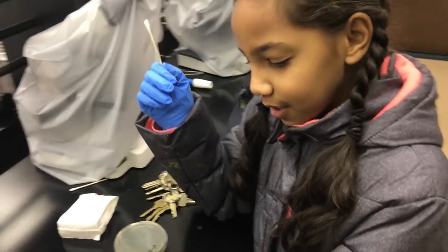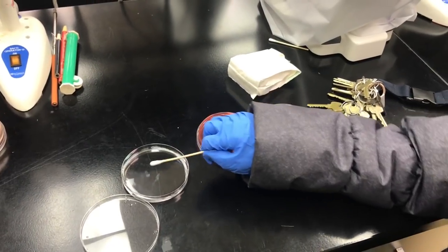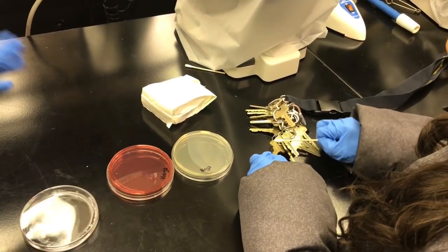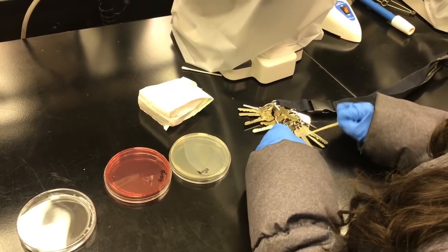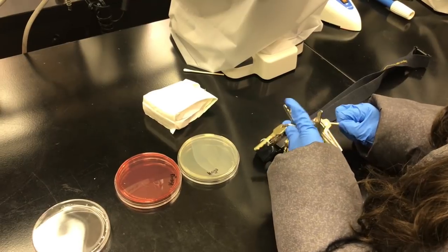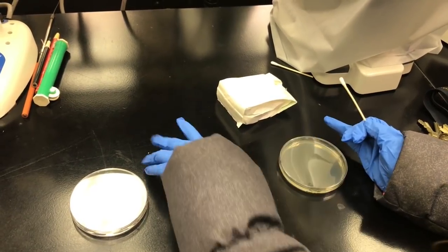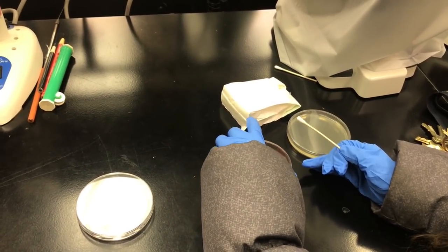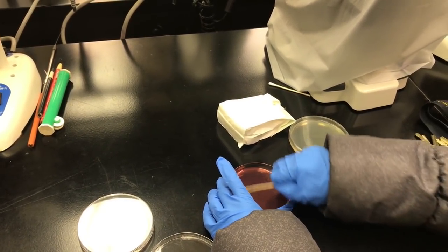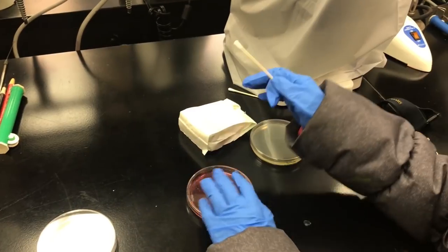Okay, so first I'm gonna just dip this in some PBS. And it's sterile. I'm going to do it on the keys. People touch keys every day. And I've seen videos where babies are eating keys. Now, what are they eating? Do one side and then you can turn the swab onto the other side.